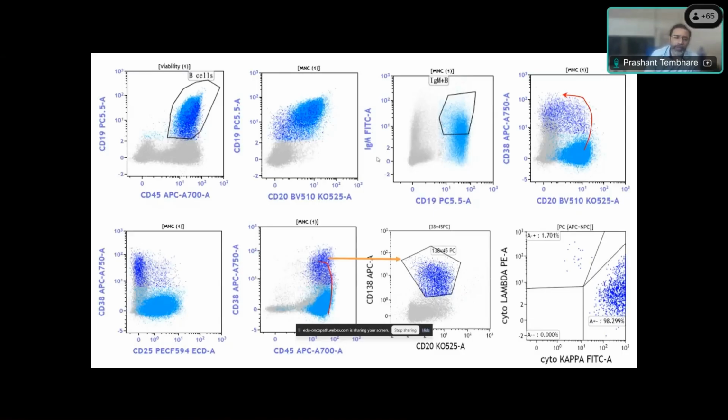If both are present, then by flow cytometry you can identify abnormal clonal B cells as well as plasma cells. And usually, as Neeraj has mentioned, they are IgM positive if there is IgM LPL, or if it is IgG, it can be IgG also. Also, the percentage of non-IgM is very low. Now, if you look very carefully at these plasma cells, you can clearly see there are B cells which are differentiating toward plasma cells. They are gaining CD38 expression and losing CD20 expression, which is the natural, normal maturation pattern of lymphocytes to plasma cells.